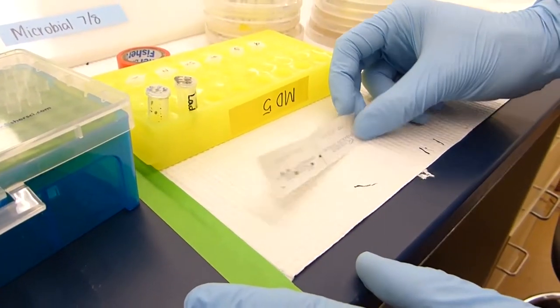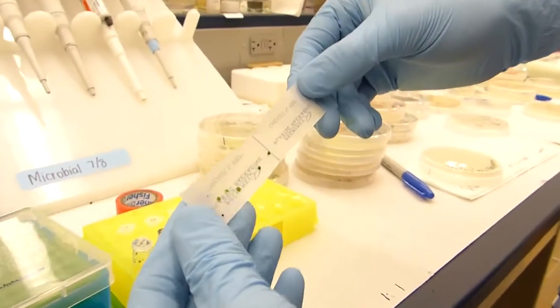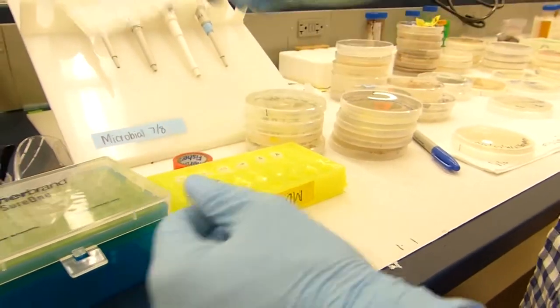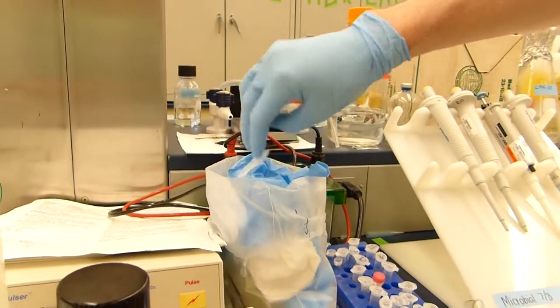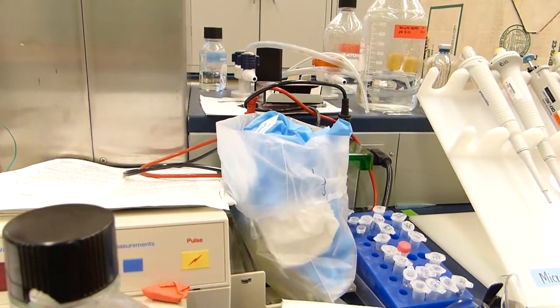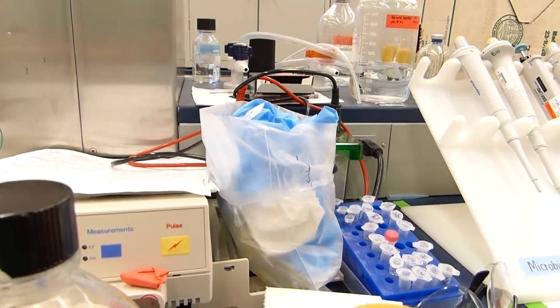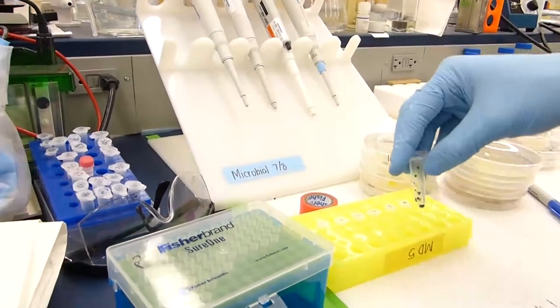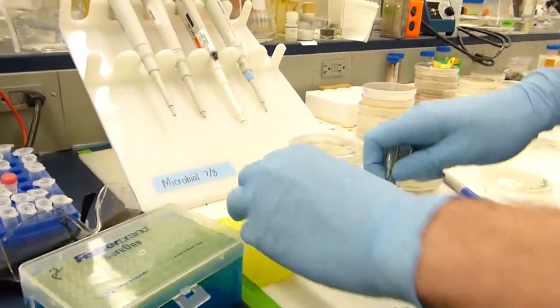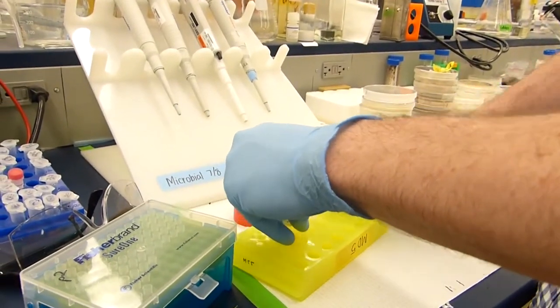During this time you can clean up your workstation including putting anything that has been in contact with the ethidium bromide liquid into a trash receptacle that you know is meant for items that have come in contact with ethidium bromide. You also will want to put your DNA ladder and loading dye back in the freezer as well as your samples. Your samples will last longer in a freezer box and if you want to use them for further downstream applications.